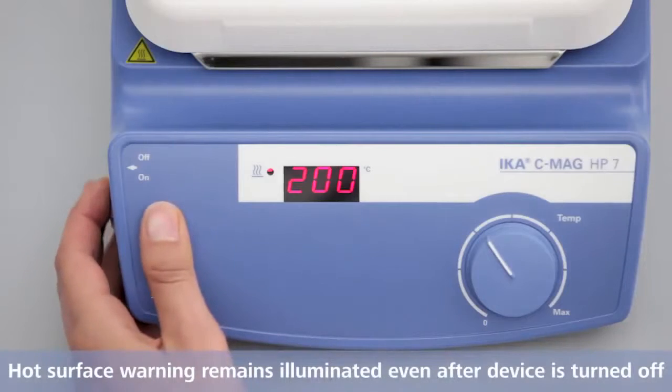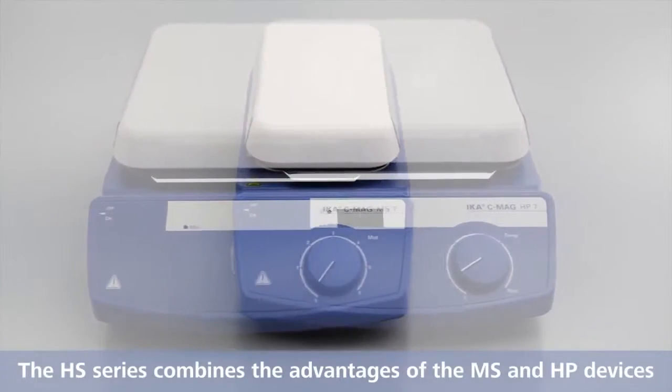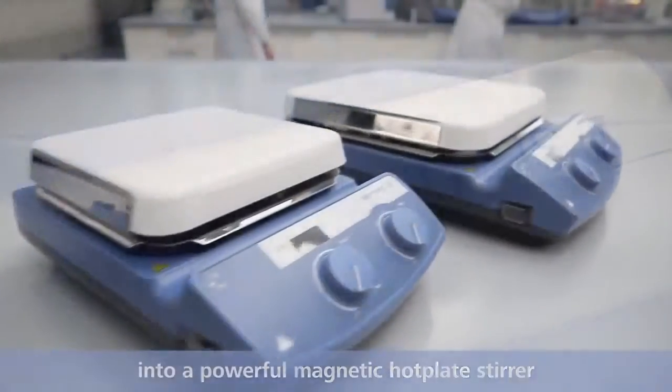Hot surface warning remains illuminated even after the device is turned off. The HS series combines the advantages of the MS and HP devices into a powerful magnetic hot plate stirrer.